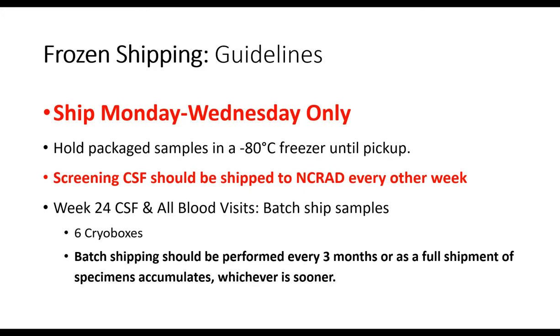So if you accumulate 6 cryo boxes in a few weeks, go ahead and send those out. But if you have visits spaced out, then please don't hold on to samples for more than 3 months. Even if you don't have 6 cryo boxes after 3 months, we ask you to go ahead and get those sent to NCRAD after 3 months' time so we can have those accounted for.